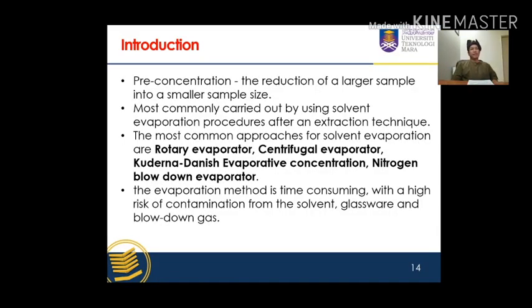There are a few types of solvent evaporation available in the lab. The purpose of solvent evaporation is to pre-concentrate the sample. Pre-concentration is concerned with the reduction of a larger volume of sample into a small sample size that is available for analysis.